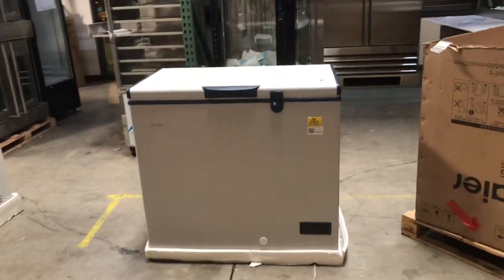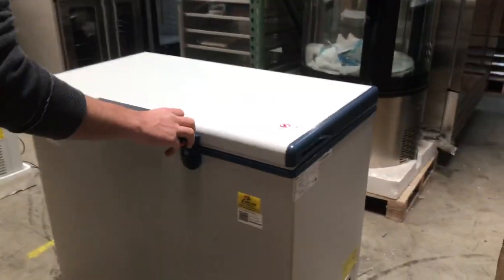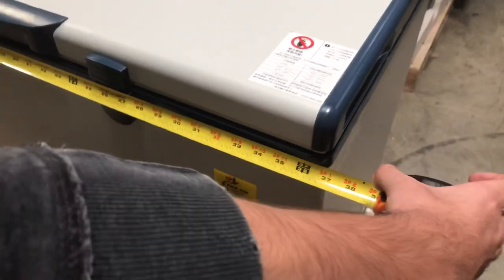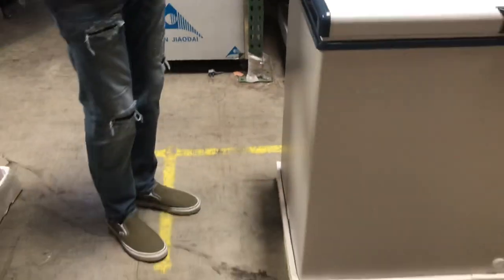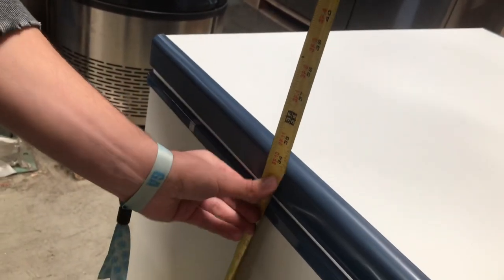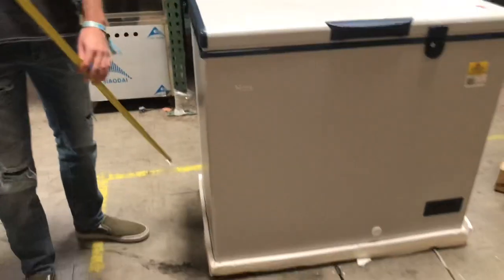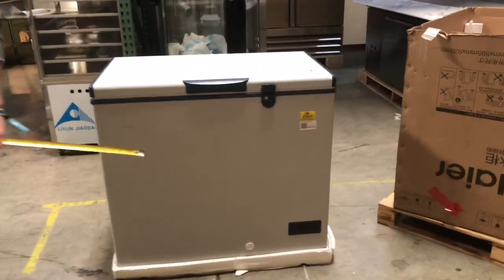Now let's go ahead and first give you the overall dimensions of this unit. For the length, you're looking at about 37 inches. For the depth, about 20 and a half inches. And this unit is going to stand at about 35 inches high. This unit does have wheels on the bottom, so you can easily move it around.